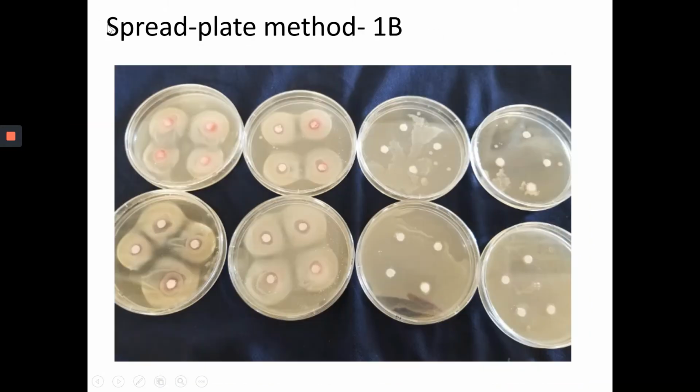And this one is what it looks like for 1B. You place the paper disc on the same day as your incubation. What I did was use very strong, concentrated lead nitrate, which is toxic and will kill the bacteria. As you can see, there is already some inhibition zone around it. Of course, some of them don't show very clearly.